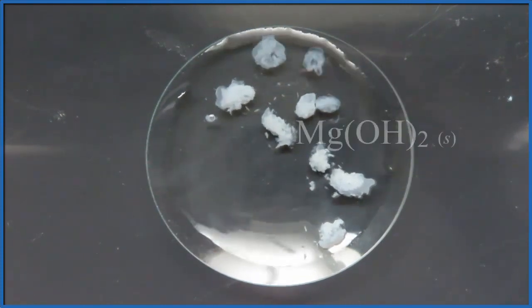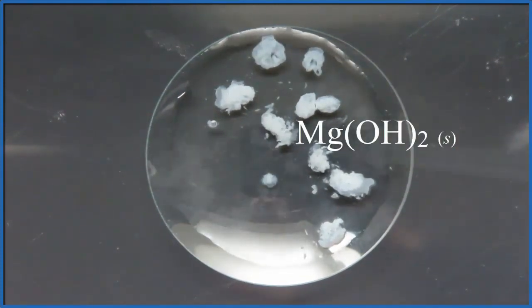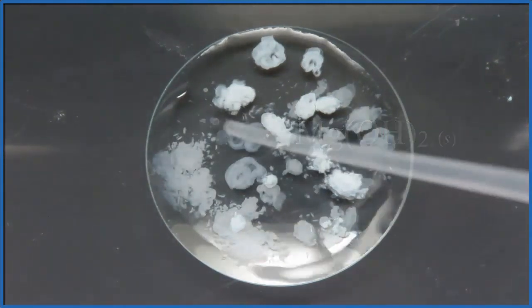That blossom is the precipitate, magnesium hydroxide. Let's go back and check on that beaker, see what's happening there.